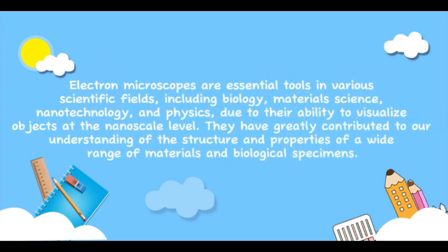Electron microscopes are essential tools in various scientific fields, including biology, materials science, nanotechnology, and physics, due to their ability to visualize objects at the nanoscale level. They have greatly contributed to our understanding of the structure and properties of a wide range of materials and biological specimens.